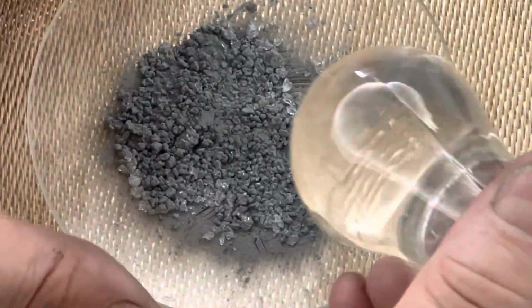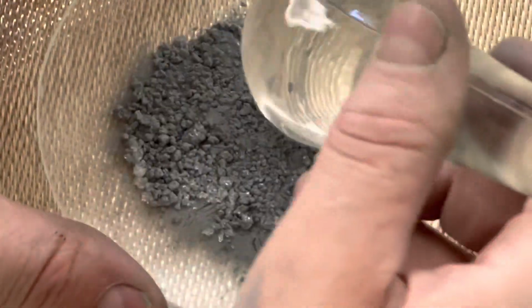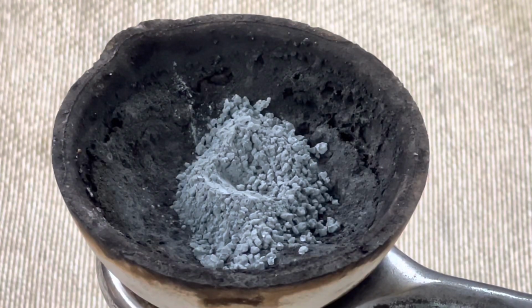For the larger crystals, I would break them up until you have a nice fine powder. Now you're ready to transfer your mixture to a crucible. Make a little divot right there in the middle for a drop of water.